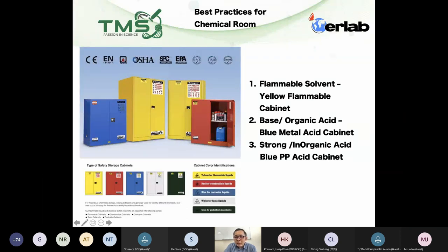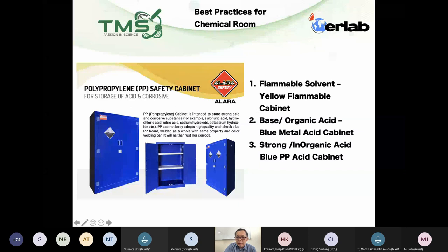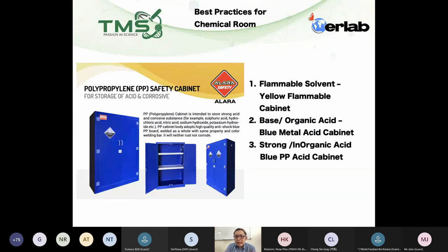For the blue acid cabinet, there are two types: a metal acid cabinet and a fully polypropylene (PP) plastic acid cabinet. My suggestion is: if you have organic acids, which are less acidic, a metal acid cabinet is fine. However, for strong inorganic acids like HCl, sulfuric acid, and nitric acid — especially in large quantities like 4-liter or 2.5-liter containers — I recommend a PP acid cabinet so your cabinet lasts longer and your chemicals remain safe.